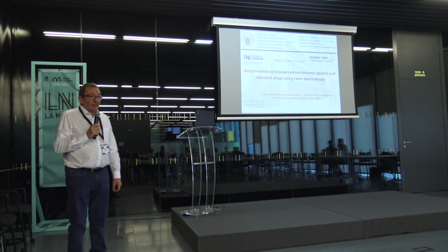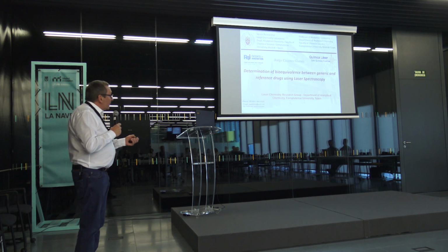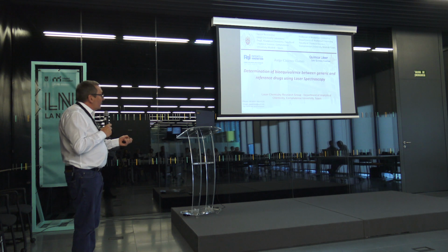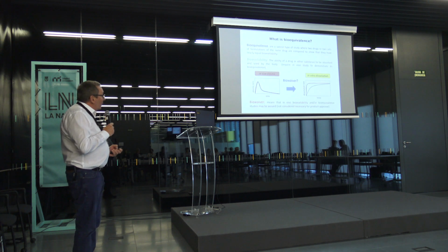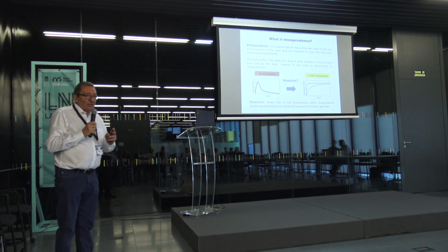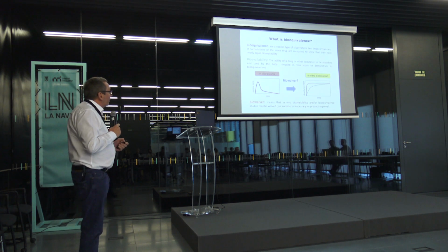I want to present the last patent developed by our group, which is related to the determination of bioequivalence between generic and reference drugs using laser spectroscopy. We want to present some concepts to understand the importance of this patent.